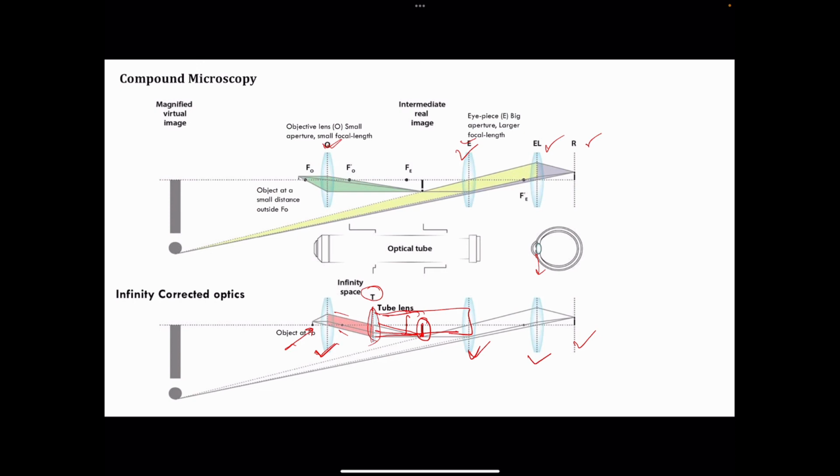And this is basically the example of how modern day microscopy methods and advancements in modern day microscopy methods have led to the development of a complex compound microscopy setup which can basically visualize all the samples that you have with good magnification and a nice resolution.